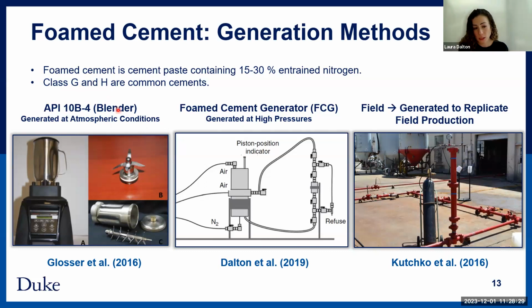But the traditional way of studying this was with a blender. You would just make these in a blender. But in reality, in the field, as you're generating these materials, the pressure is changing as you're going down and pumping it below ground. So only studying at atmospheric conditions was kind of a problem. And so this foam cement generator was developed by Derazier way back in 1991. We made one and we studied this.